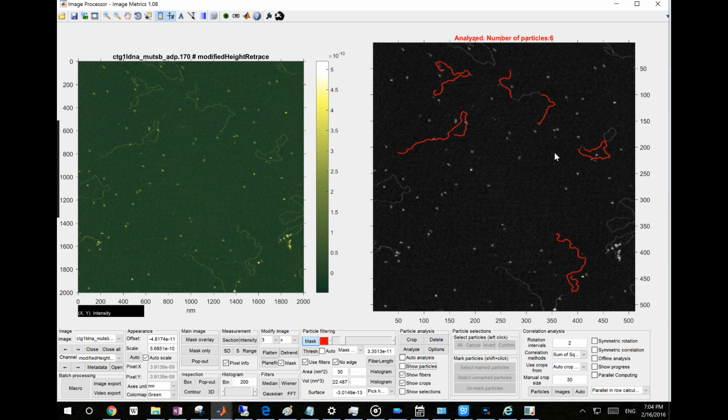This is a longer DNA. And there are use cases where we want to separate those DNAs, the short ones from the longer ones. But sometimes the DNA coiled like this is not a correct representation of that DNA molecule. This is just used as an illustration, right? This sample is randomly distributed, but I'm sure there are other mechanisms that you can use to make the DNA align in certain directions, and that way you can basically sort the DNA by length using the fiber length filter.